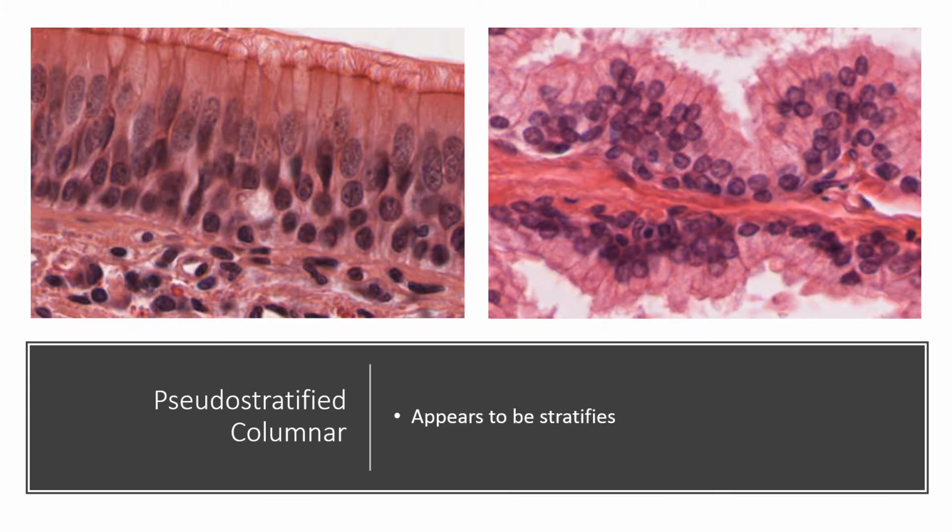Now this is that pseudostratified columnar epithelium that I talked about. Here you can see these are very clearly rectangular shaped cells, but look at the nuclei. It really looks like they were mixed up in a cup and then thrown onto the image, right? They're just a jumble. We couldn't really draw a line from one nucleus to another and form straight lines.